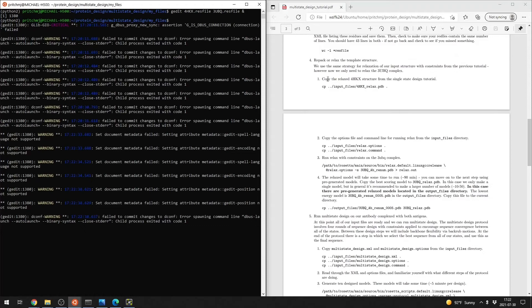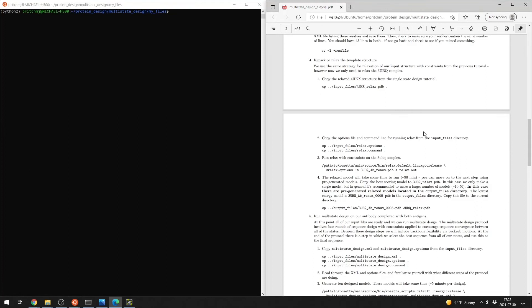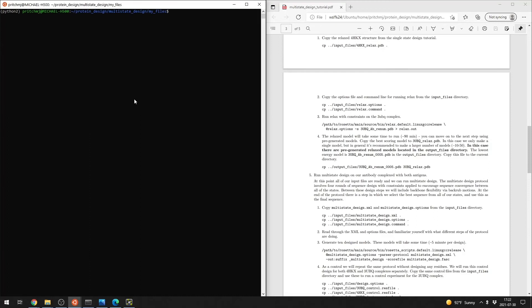We're going to do the same repack and relax as we did for the original structure. Again, this takes approximately 90 minutes, so we're not actually running it in the video. We pull the appropriate PDB from the output — in this case number five — and rename it.